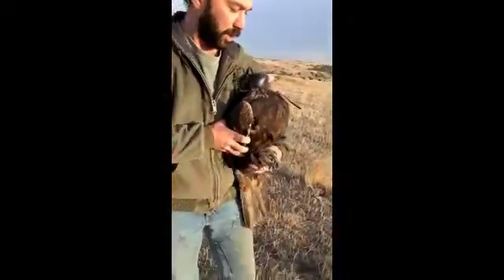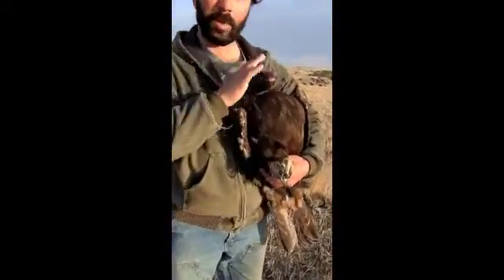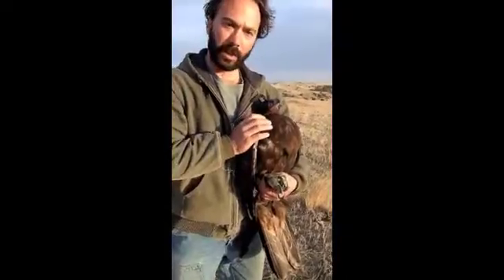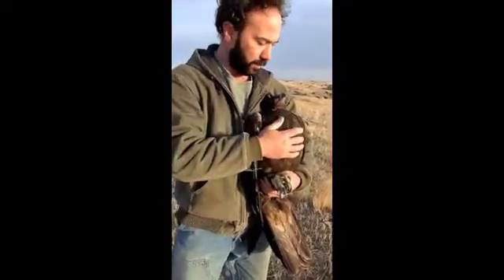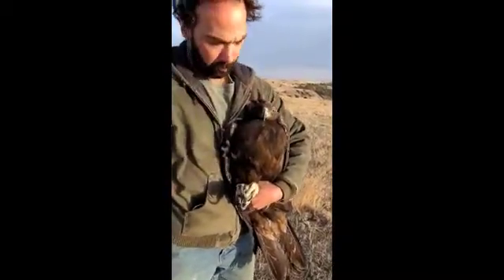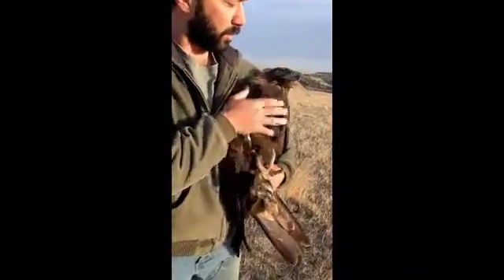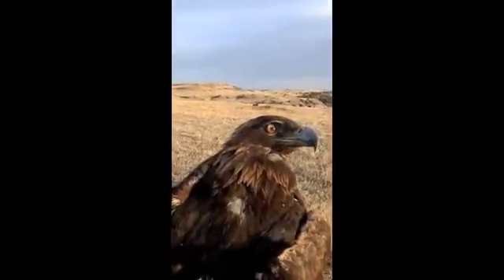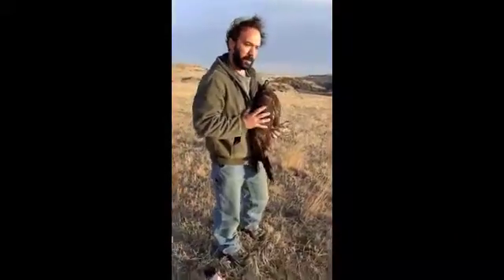We'll take his hood off. With the hood on, everything's safe — they're calm. As soon as I take the hood off, he might get a little restless wanting to get out of here. Perfectly understandable. So here you can see his beautiful golden eyes. Now we'll let him get back on his way.